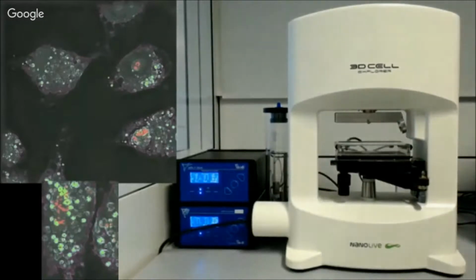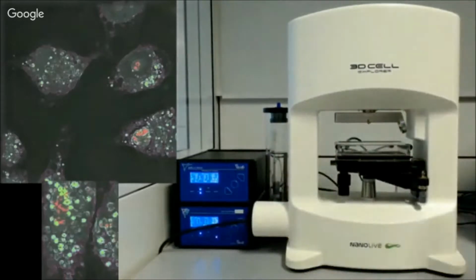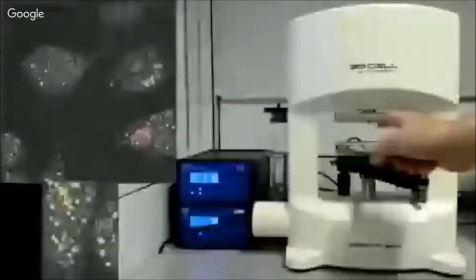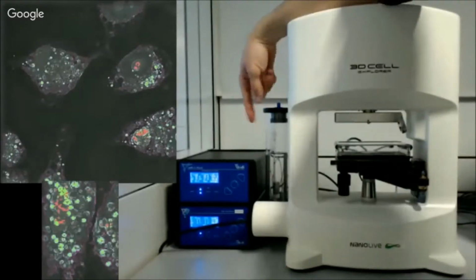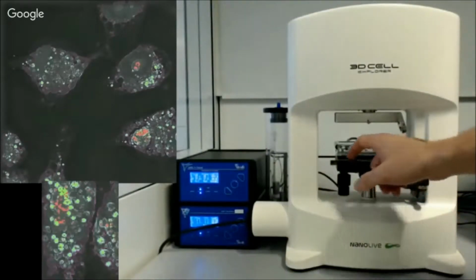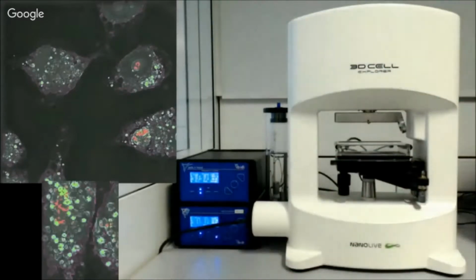Now, thanks to this incubator that we developed in collaboration with EBD, you can control a lot. There is a sensor for humidity and temperature, so you can really control the humidity thanks to this column here. You can control the stream of CO2, so you can have pH control, and you can also control the level of oxygen and nitrogen that you inject into this incubation channel.